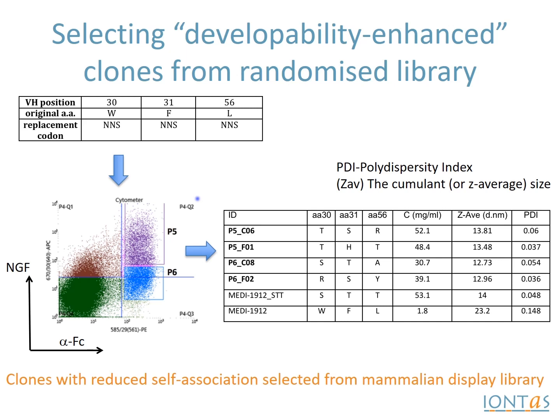So in total there was something like 27,000 nucleic acid variants encoding something like 8,000 amino acid variants. This again was introduced into HEK293 cells by nuclease directed integration. After growing in antibiotic, the population was sorted on the basis of Fc expression as shown in this flow cytometry dot plot. Again, the clones were recovered and were expressed and sequenced.